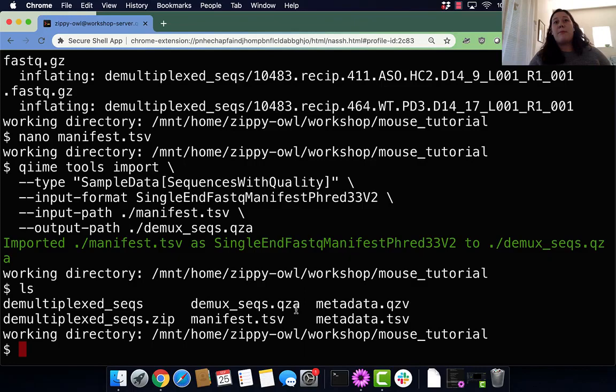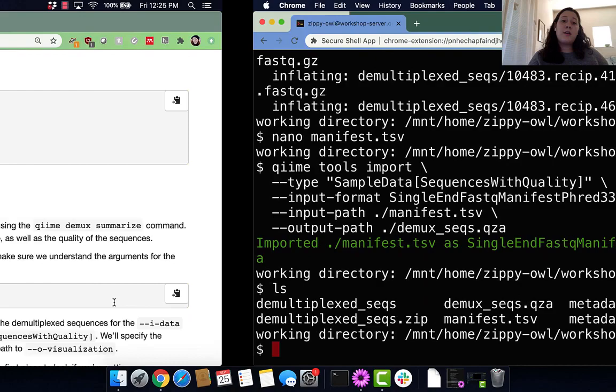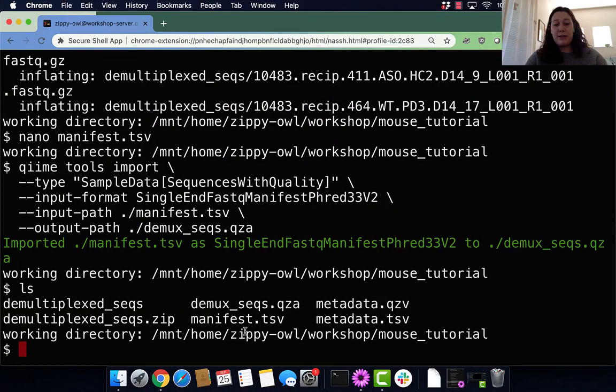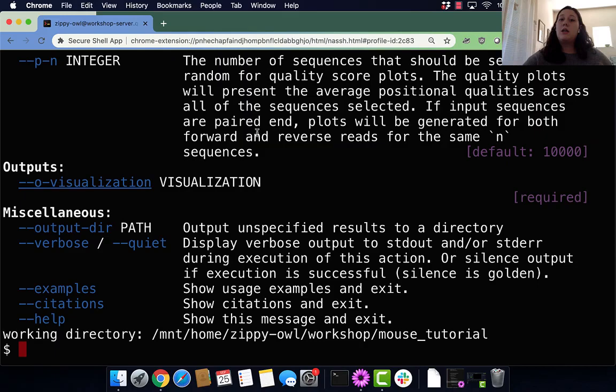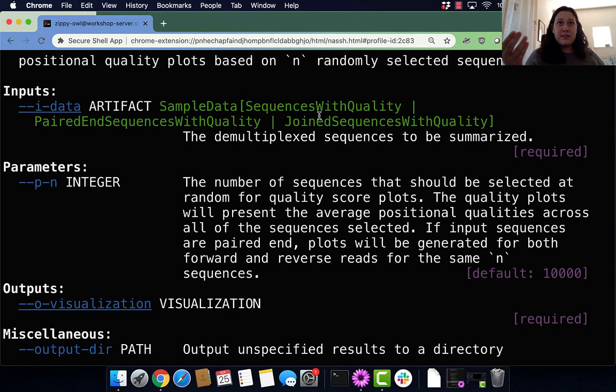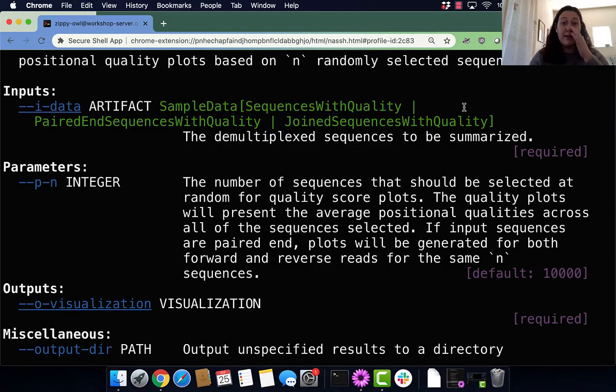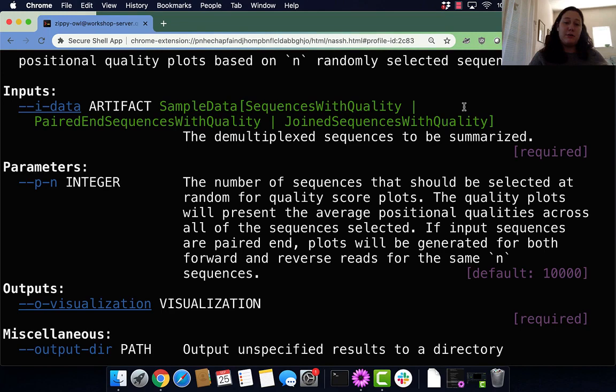Now we need to look at our data. We need to run qiime demux summarize in order to get a visualization. Most QIIME commands you can run dash dash help to see more information. Here we can see we can input data as an artifact. The sample data sequences with quality should look pretty familiar. Paired-end sequences and joined-end sequences are also inputs this command takes.